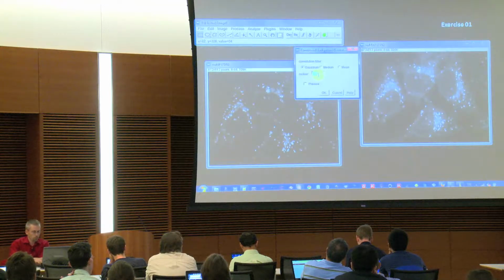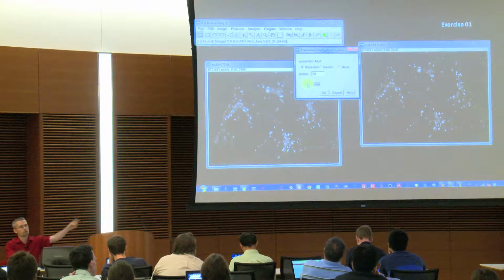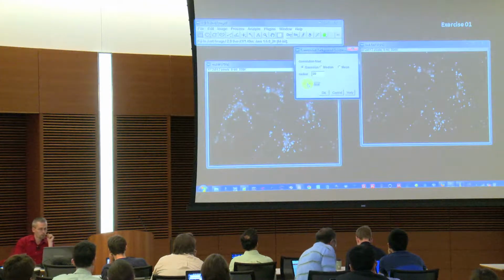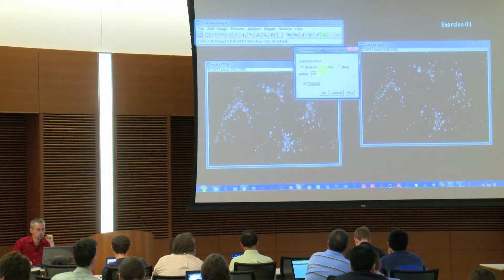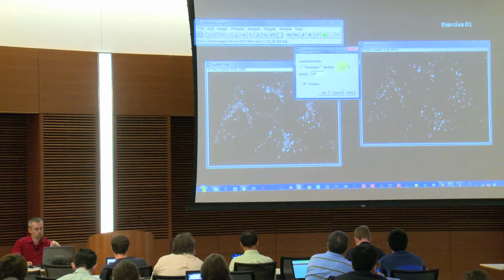So, and then you see if I, for example, use now the same size I measured and use the Gaussian filter, click on preview, you directly see also how it subtracts the image. Now you can, if you did it beforehand, compare that. That is already subtracting more than the subtract background would do. And then you see if we switch to other methods like the median, it does it especially in between the features stronger, and the mean as well.